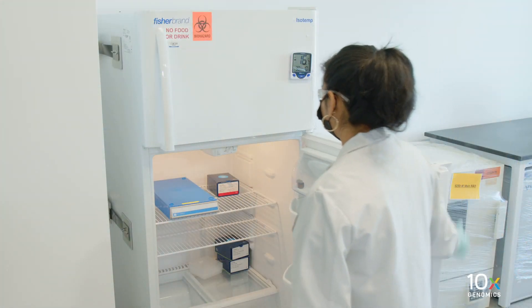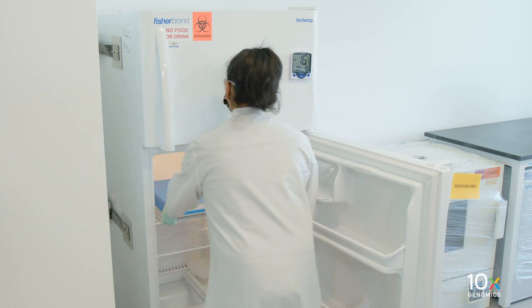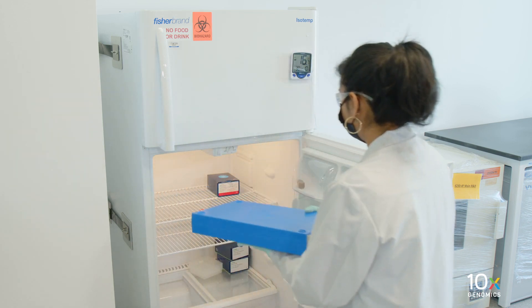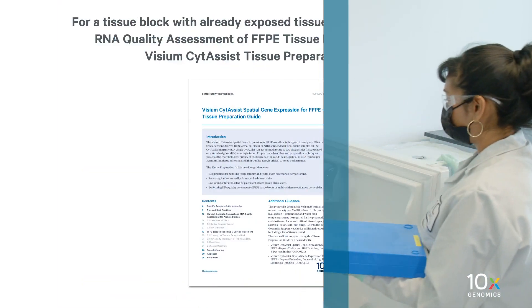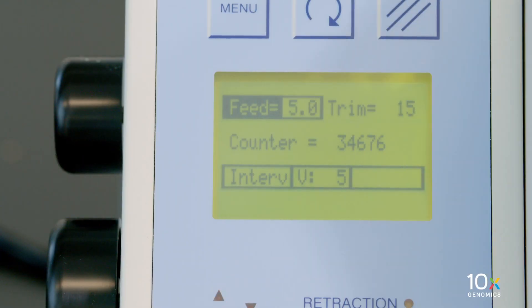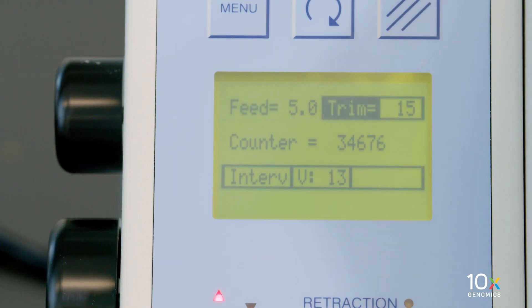Remove the tissue blocks from storage. For a tissue block with already exposed tissue, proceed directly to the RNA quality assessment of FFPE tissue block section in the Visium SideAssist tissue preparation guide. For a tissue block without exposed tissue, set the microtome to the 15 micron setting.